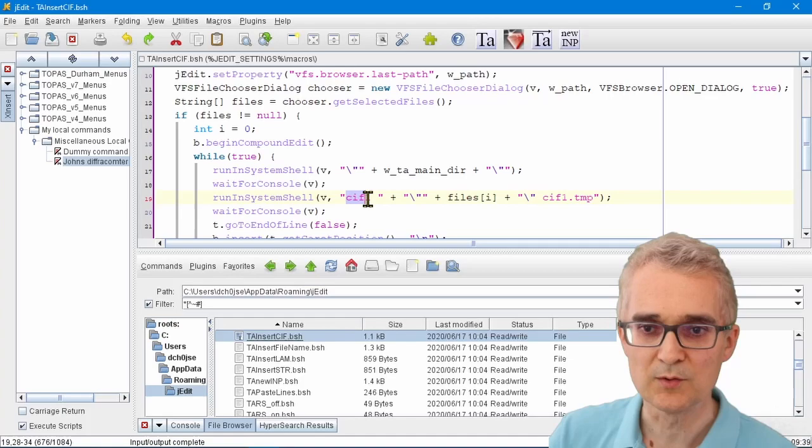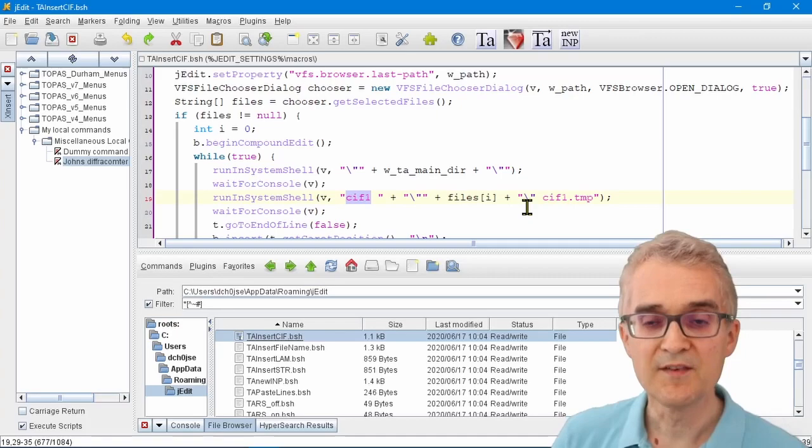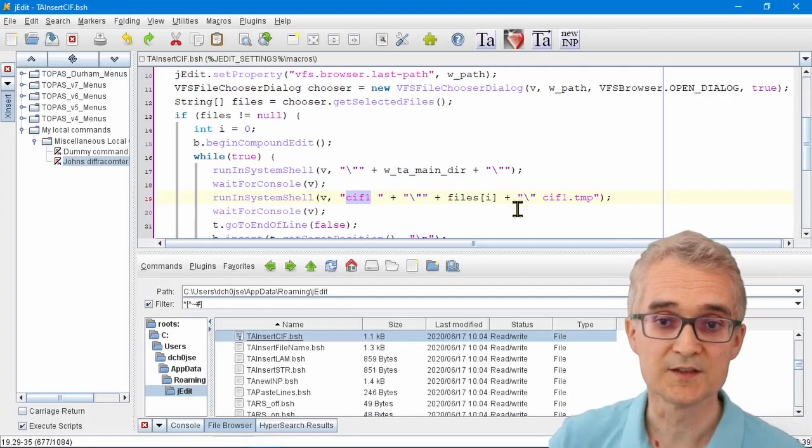If you've got a different program that you want to use to process your CIF files, then you can just change the name of this text here.